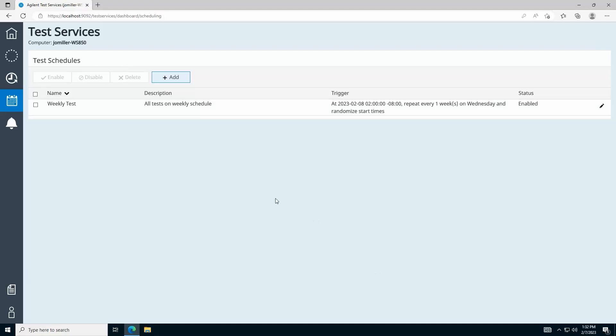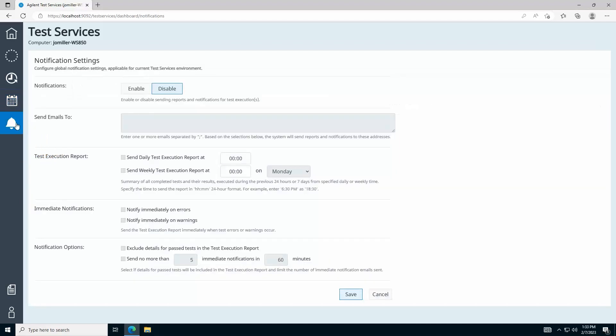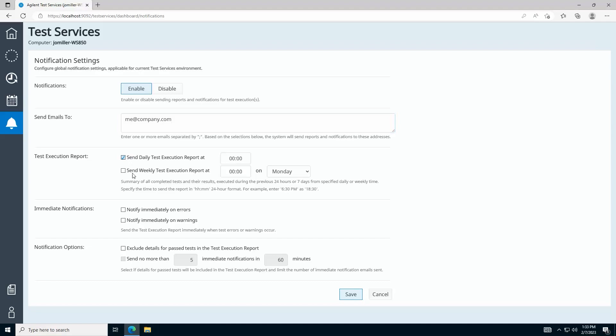In Notification Settings, found here, you can also configure email notifications to inform you of errors or warnings encountered during test execution, and schedule automatic notification emails to receive the most recent test results on a daily or weekly basis.